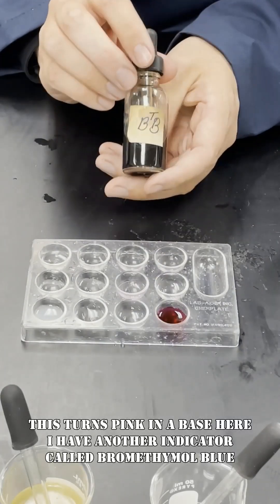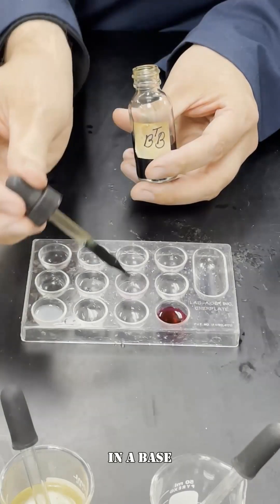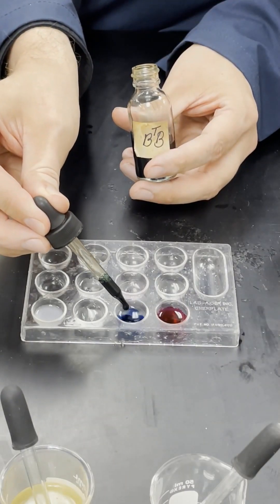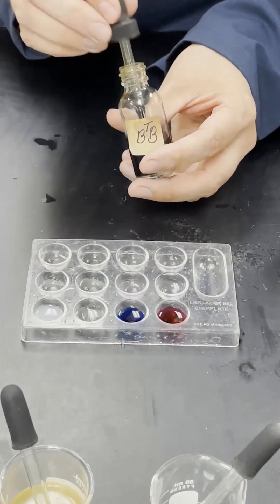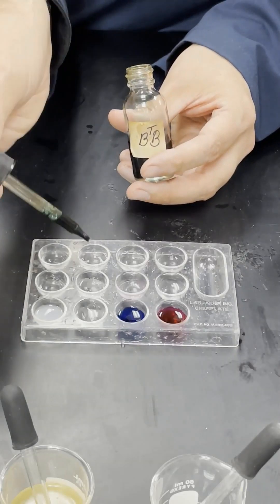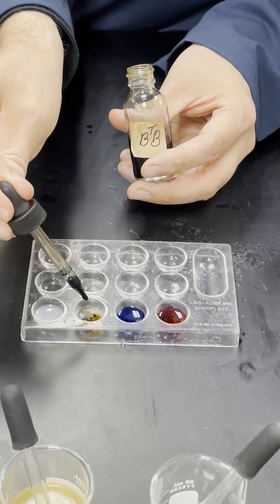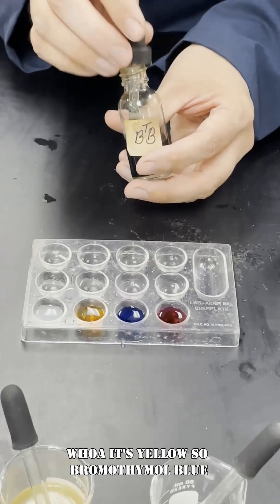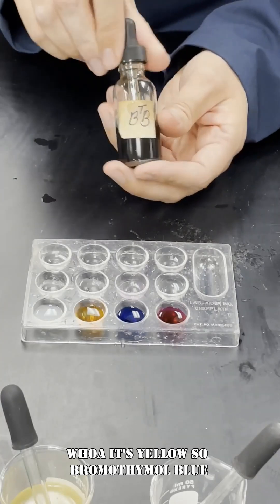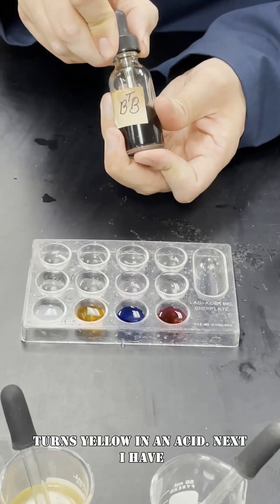Here I have another indicator called bromothymol blue. In a base, it's blue, and in an acid, whoa, it's yellow. So bromothymol blue turns yellow in an acid.